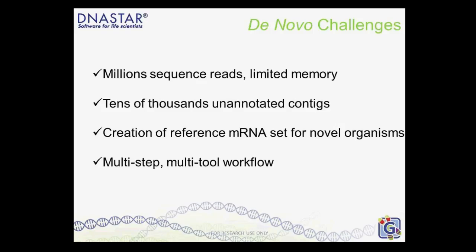And so we develop new algorithms that can handle those data sets on a desktop computer, and do it relatively quickly. And then on top of that, it can create a reference mRNA set for those novel organisms. And that's the key part.